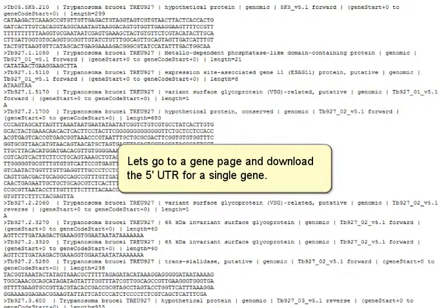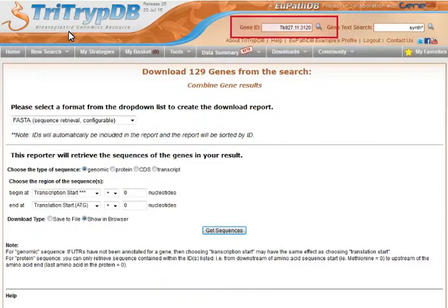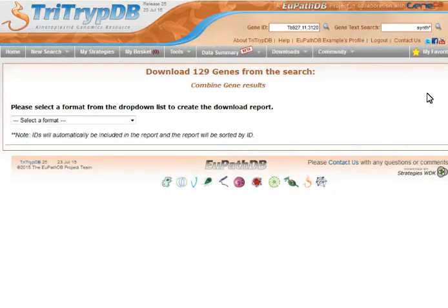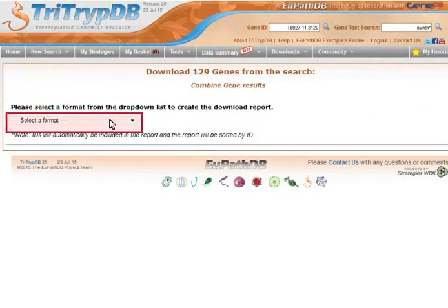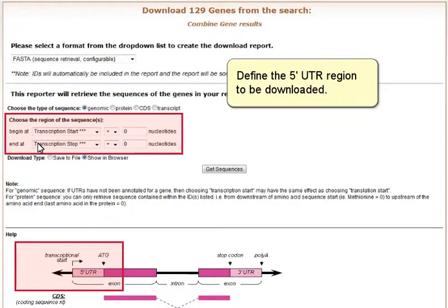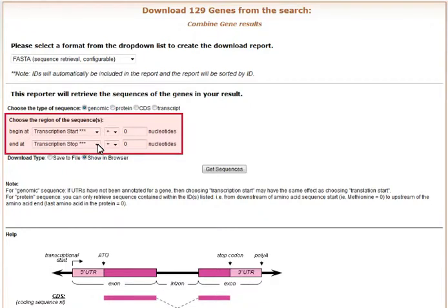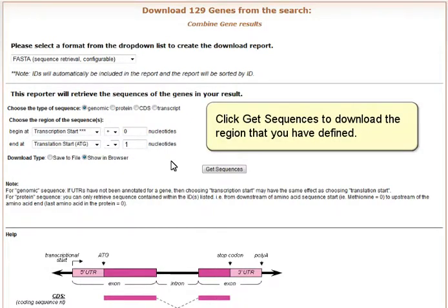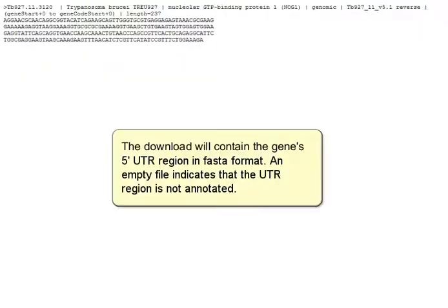Let's go to a gene page and download the 5' UTR for a single gene. Use the download link in the upper right corner of the gene page. This option leads to the configurable FASTA download that was just described. Choose the FASTA format. Define the 5' UTR region to be downloaded. Click Get sequences to download the region that you have defined. The download will contain the gene's 5' UTR region in FASTA format. An empty file indicates that the UTR region is not annotated.